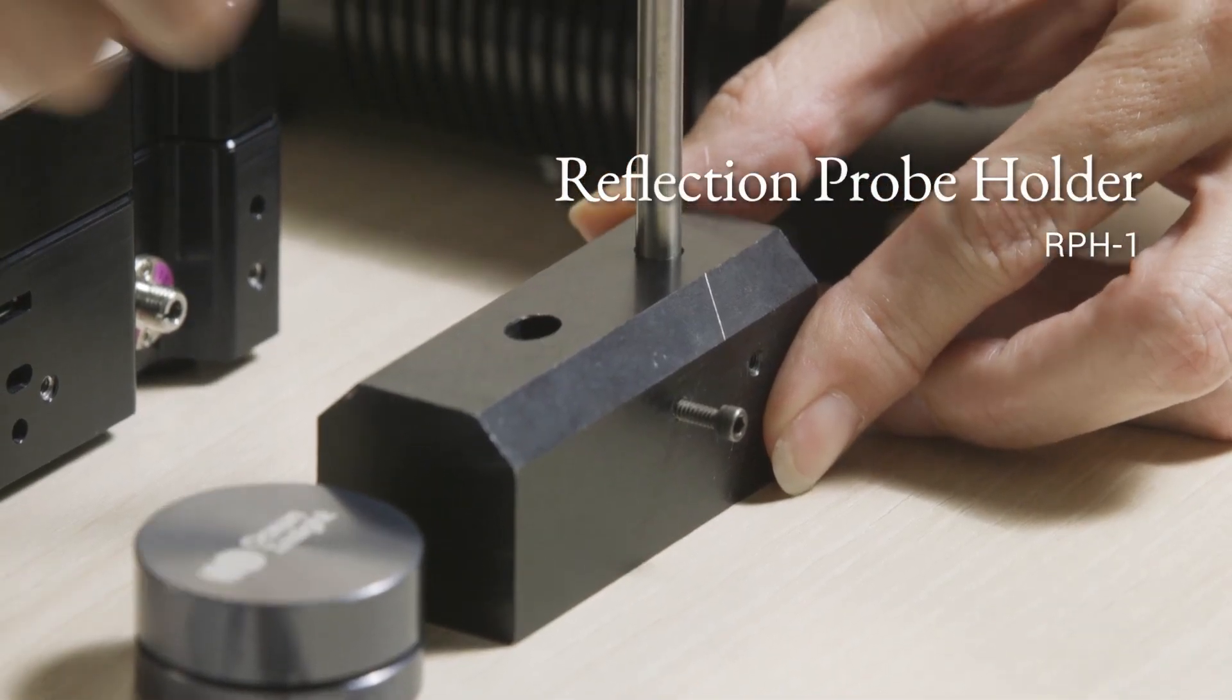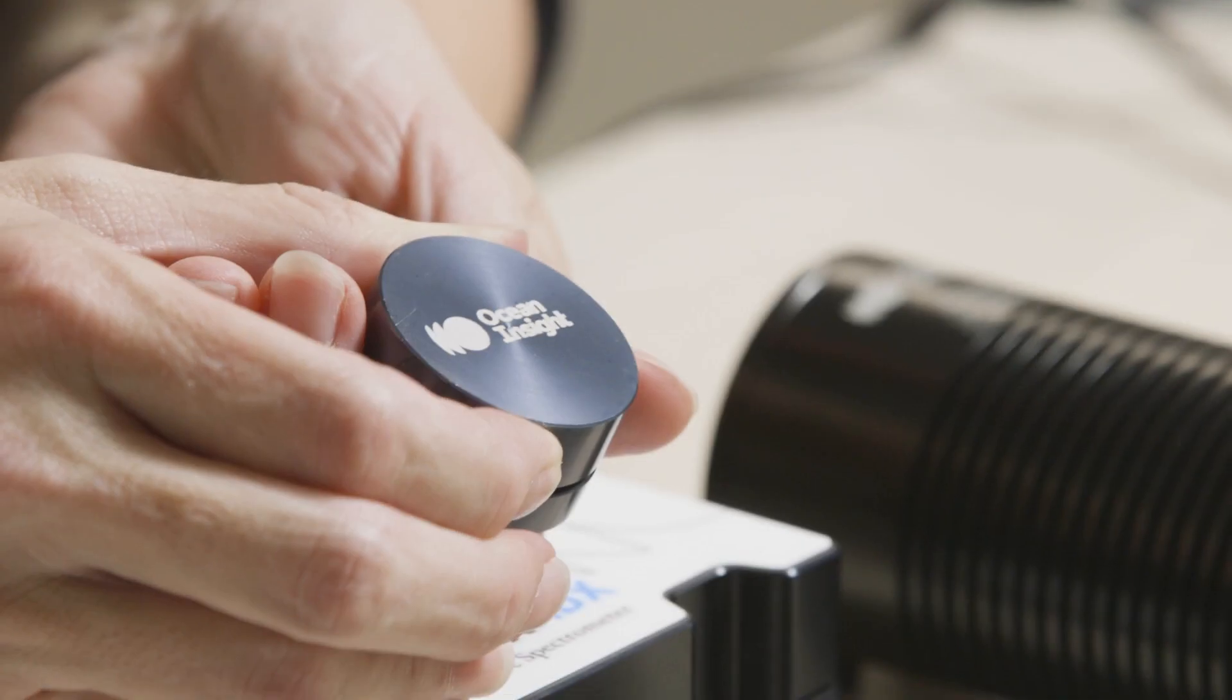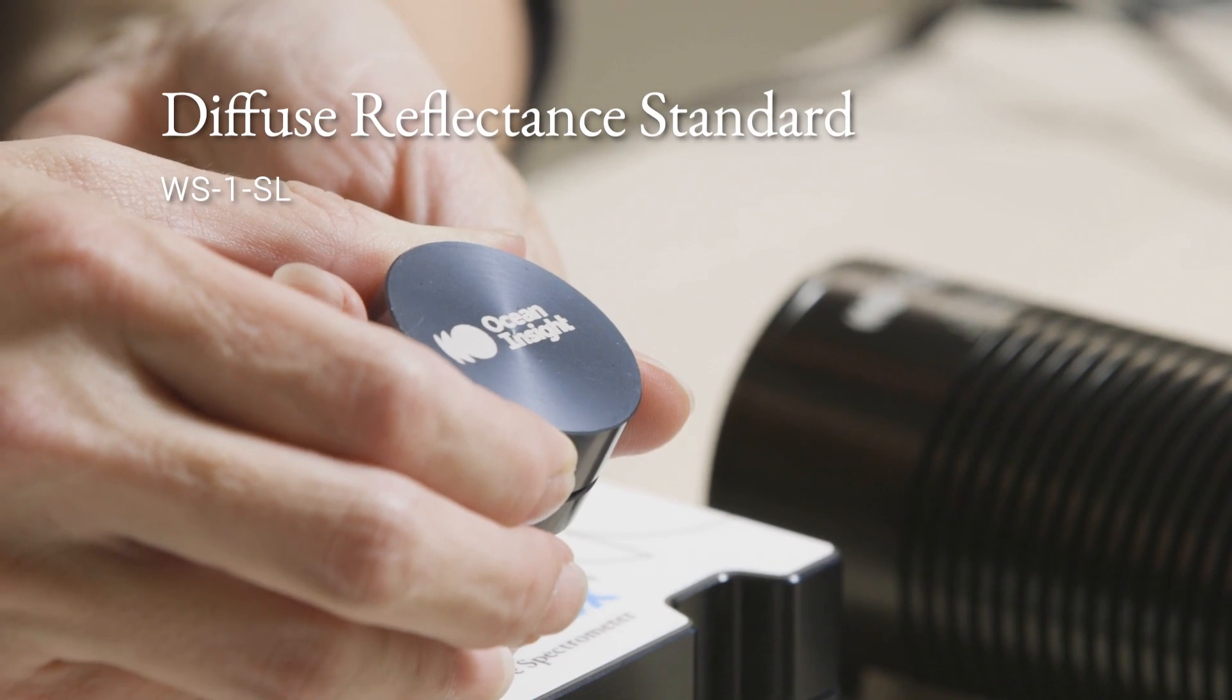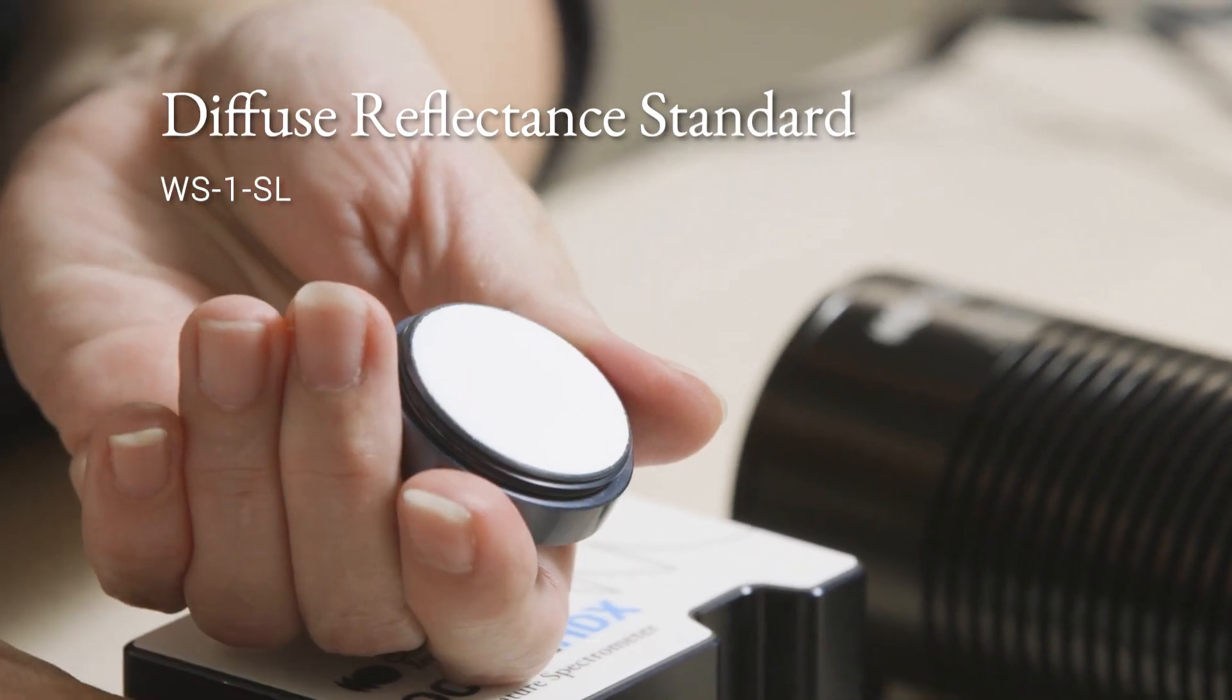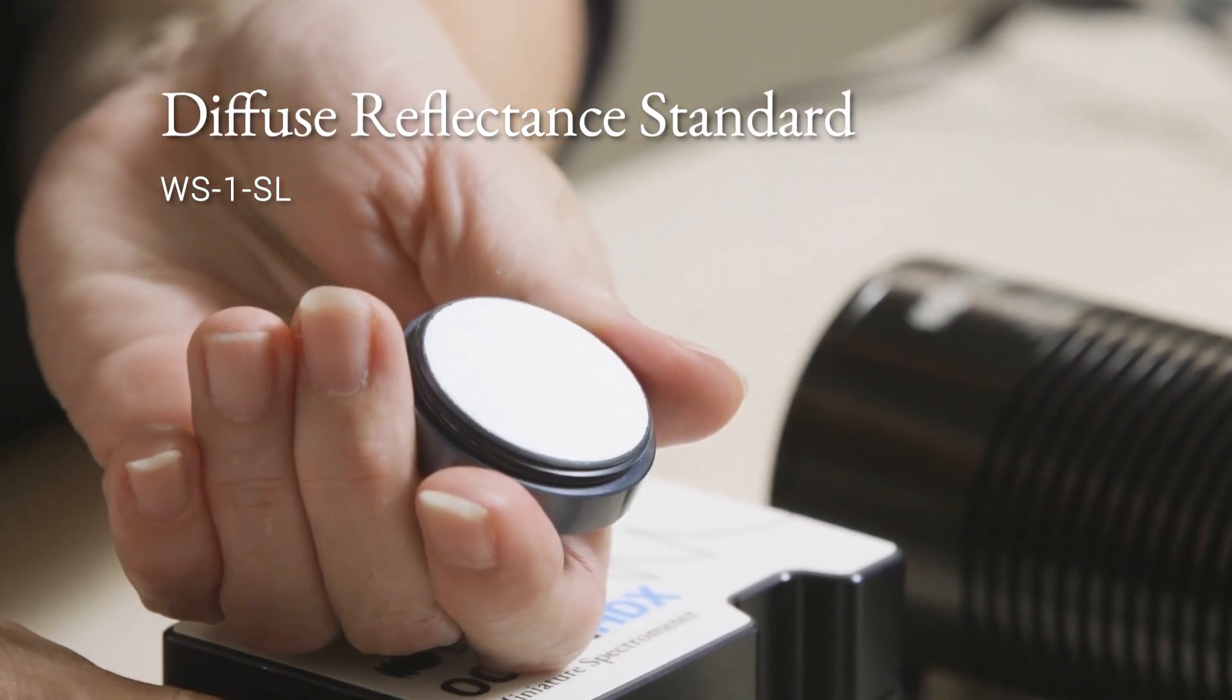The other accessories that we have here are our reflection probe holder, and then we have our reflectance standard, which we're going to use to take the reference for our reflectance measurement. In this case, we're using a spectralon standard, the WS-1.